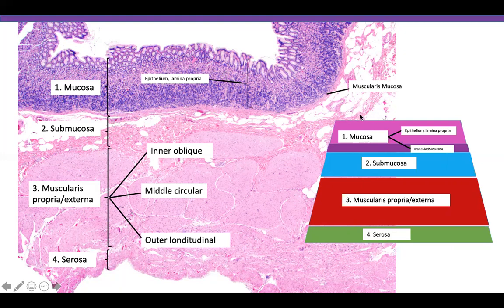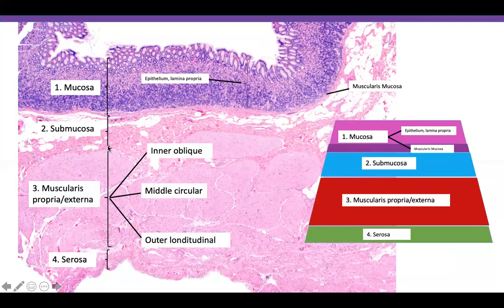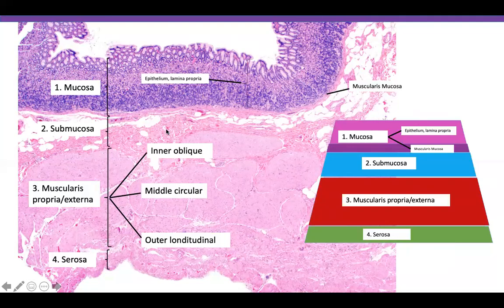The epithelium is the surface layer. The lamina propria is the space between the epithelium and the thin layer of muscle called the muscularis mucosa. The submucosa is the next section, composed mainly of fat and some fibrous tissue.